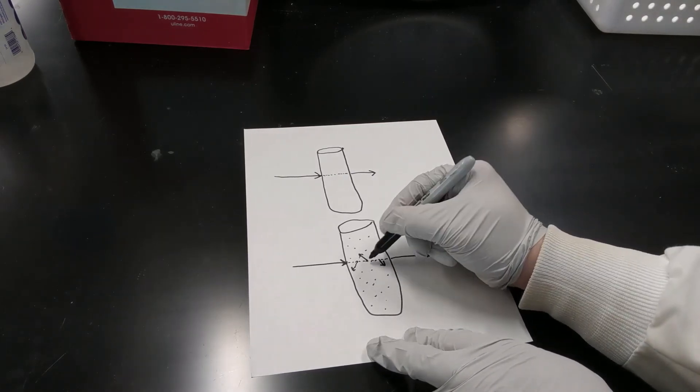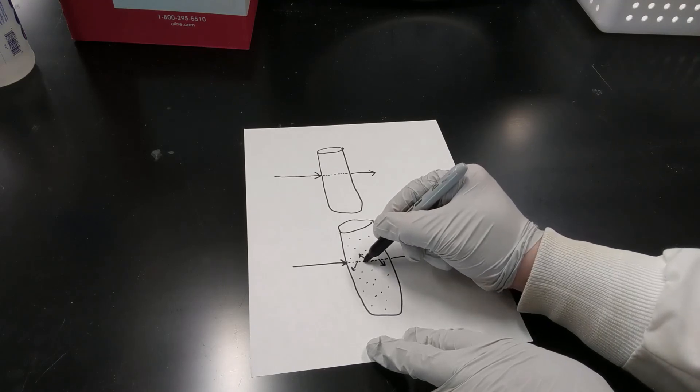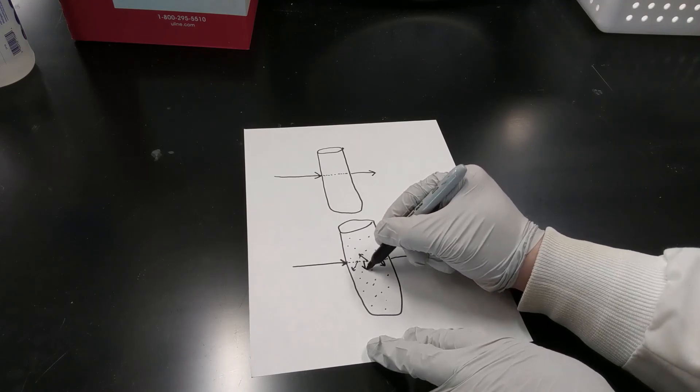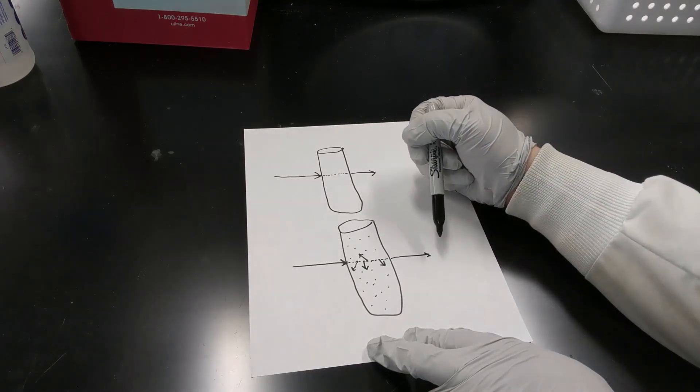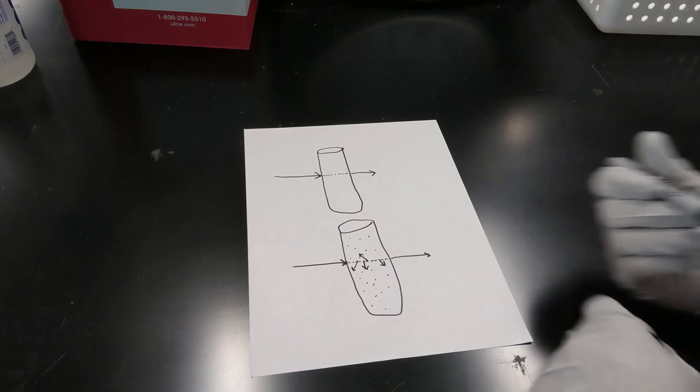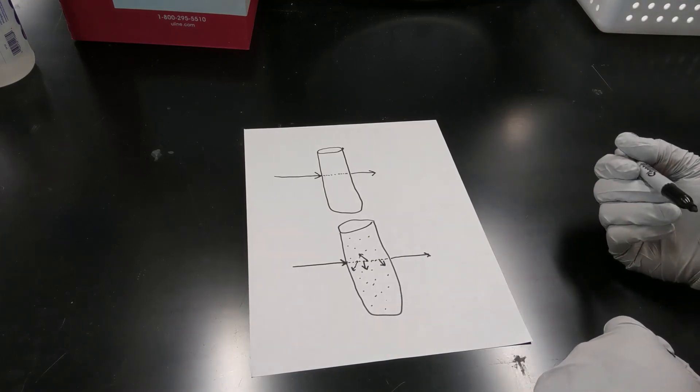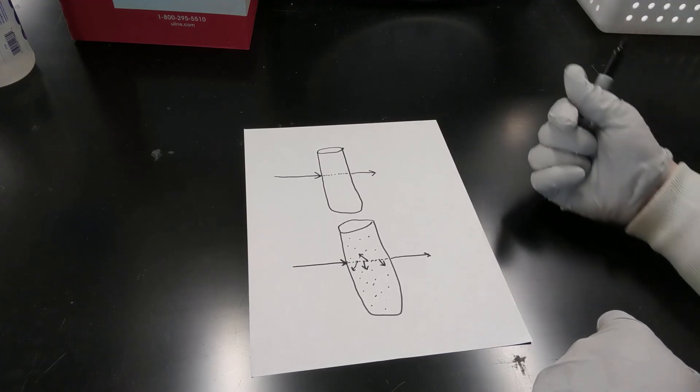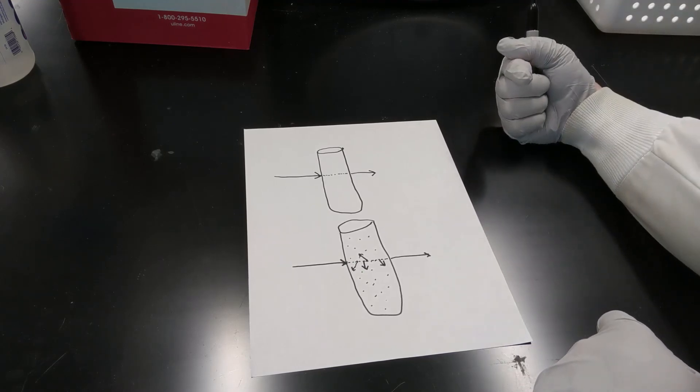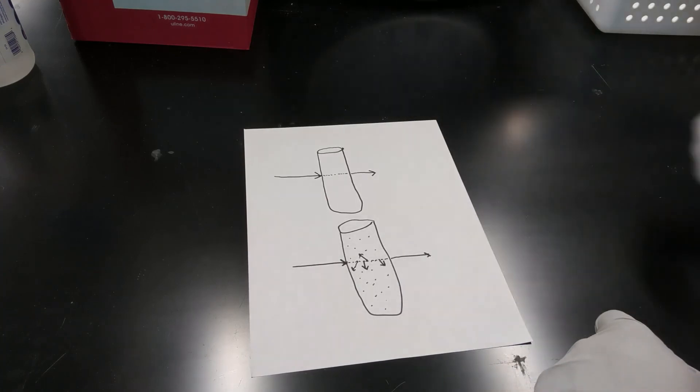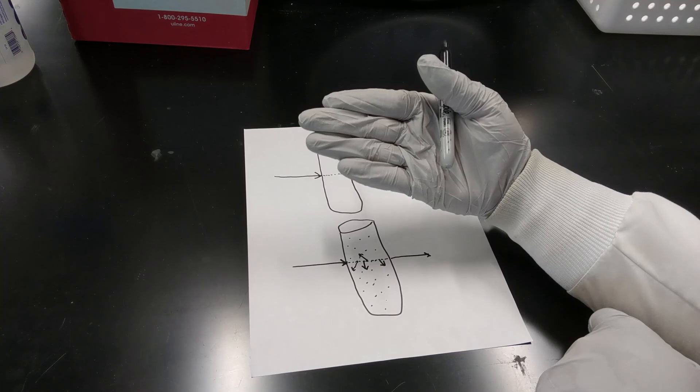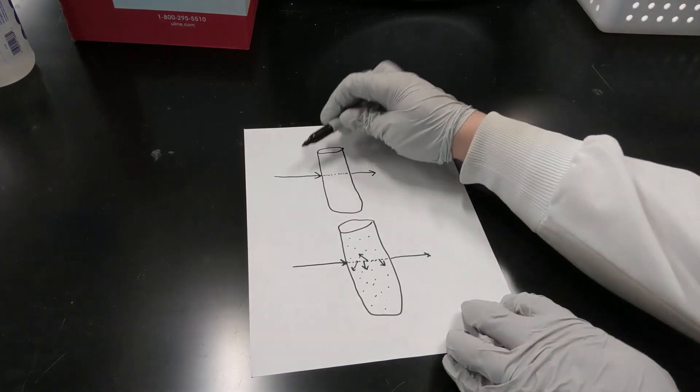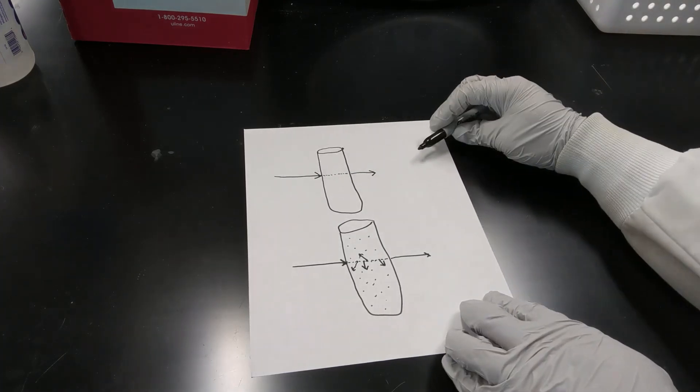That said, what the instrument is doing is it has a detector sort of coming out this way. So for any light that hits a particle and bounces perpendicular to the angle of incidence of the light that was coming in, that's going to get captured by our detector in the instrument. And that's what it's really measuring is how much light is coming out at a right angle from the light that was going in. That way it's not measuring any of the light that it's putting in if it goes through a completely clear solution.